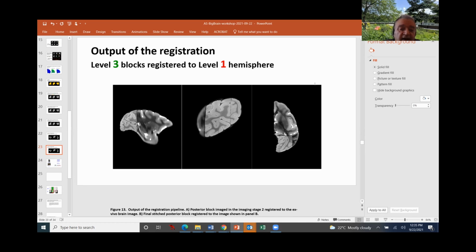And obviously the macaque is a good model to test methods used in humans, where we all know that with humans, we cannot control, we get a brain sometimes many hours after the death. The brain is not fresh anymore, and not always do we have MRI of this brain, etc. So this method allows for verifying methods that are used in humans.